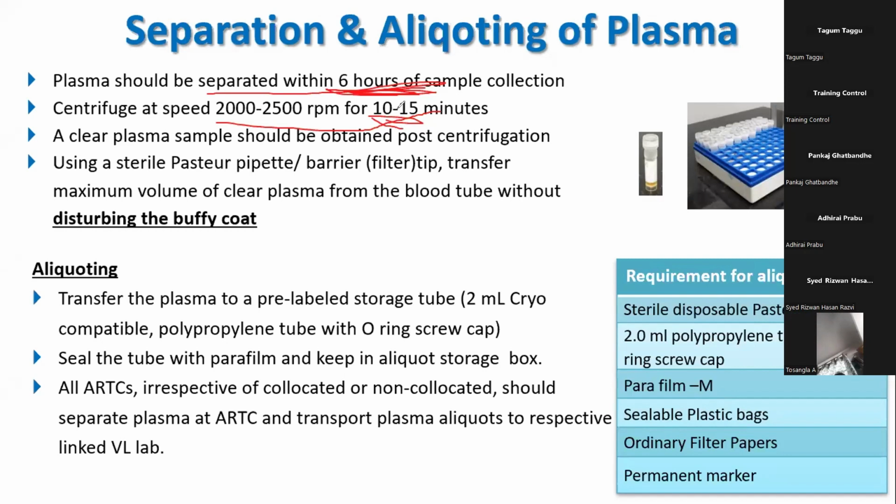Use either pipettes. If you have pipettes, ensure that you are using aerosol barrier tips. If you do not have pipettes, make sure you are using single wrapped pasteur pipettes. The pasteur pipette is similar to a dropper. You will get it in either bulk or single wrap. Ensure you have single wrap and sterile. This avoids any contamination or any dust, and maintains the stability as well.